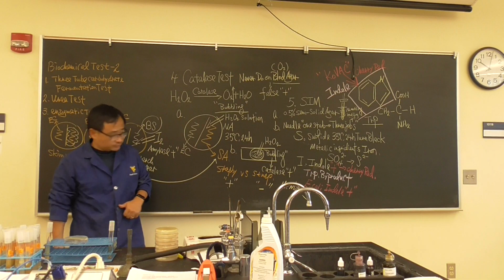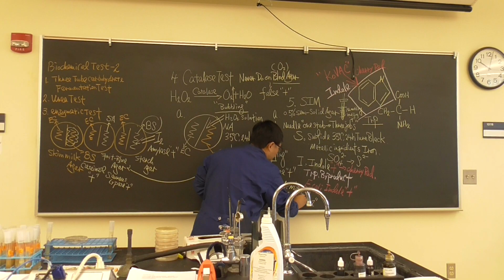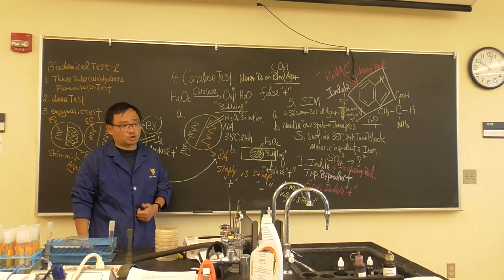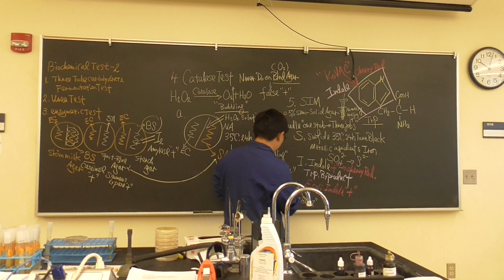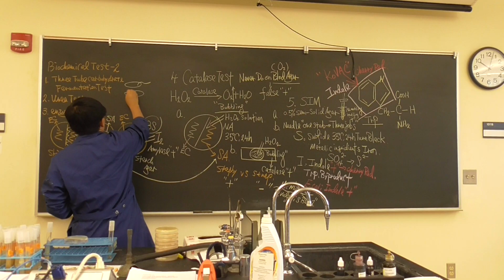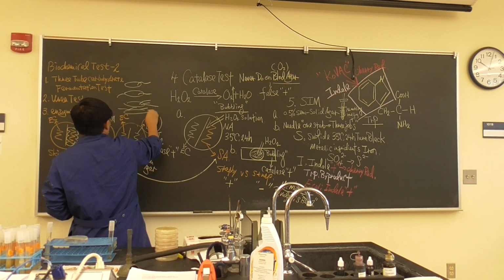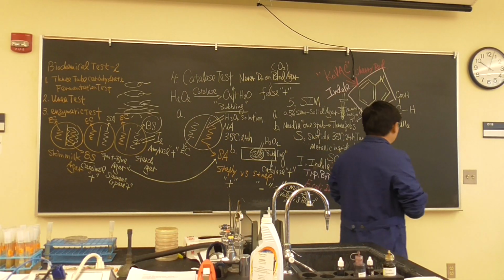In class we talked about Proteus vulgaris. However, it is a biosafety level 2 pathogen. We're not going to do that. Instead we use a surrogate bacterium called Citrobacter. We did that already. Okay? So that's the last one, motility. Now motility is related to flagella. That's what you learned in your class. Monotrichous, amphitrichous, lophotrichous, and last one, peritrichous. That's something you need to know in the lecture, it's important.